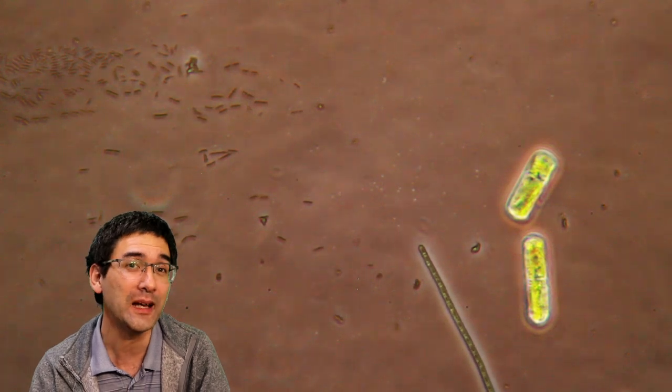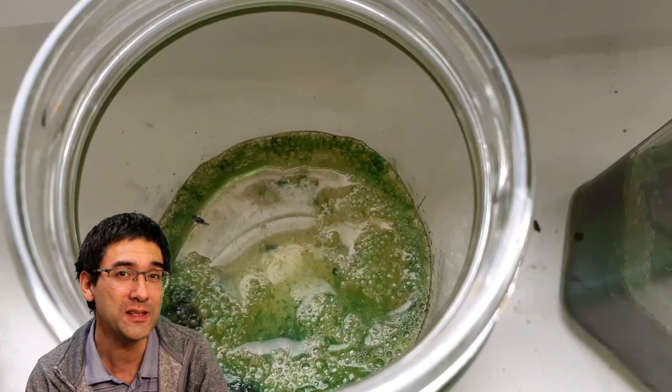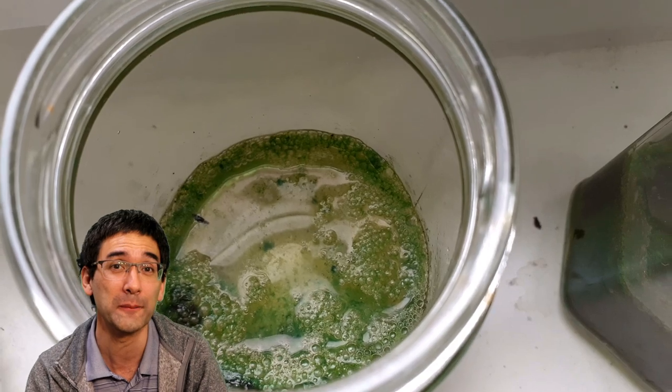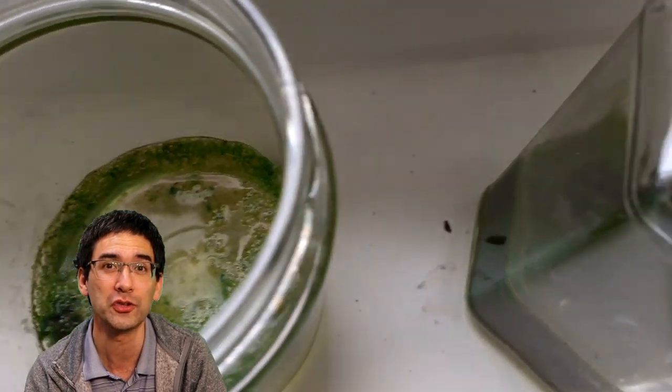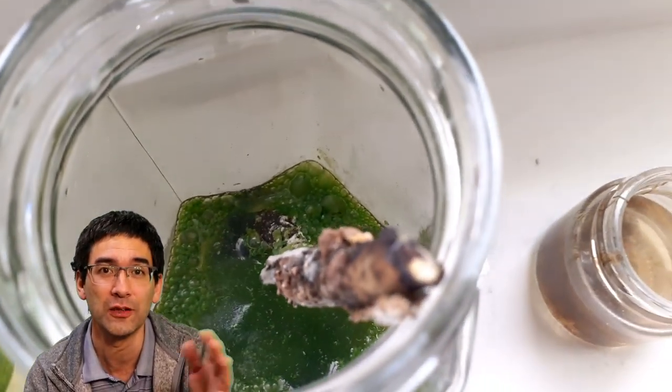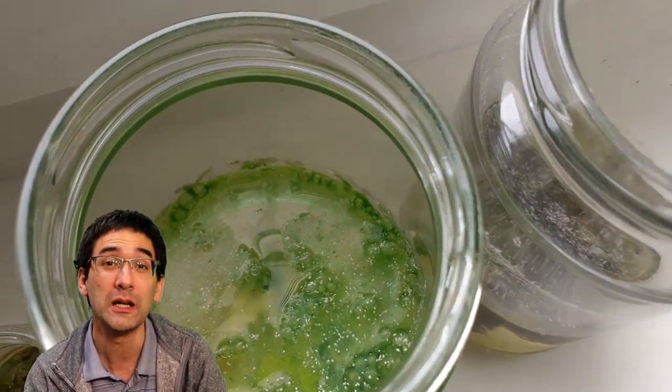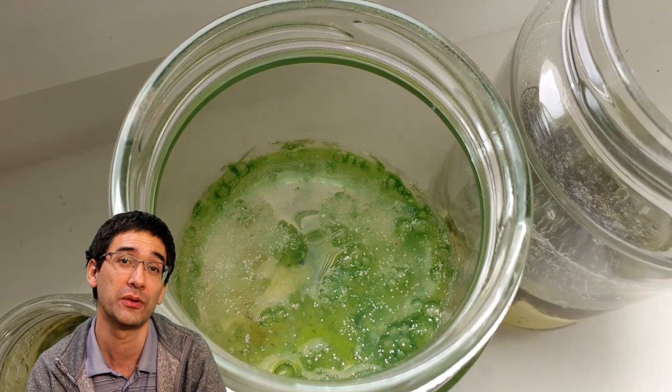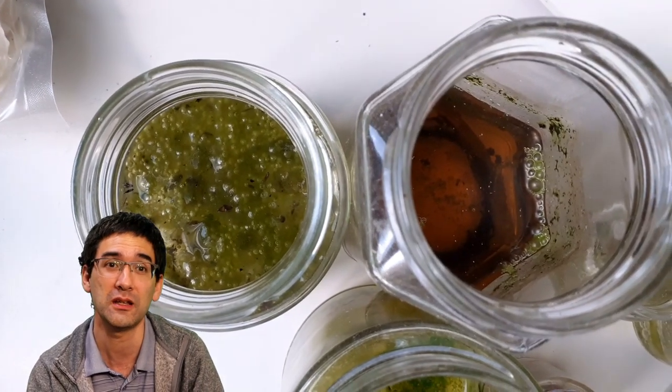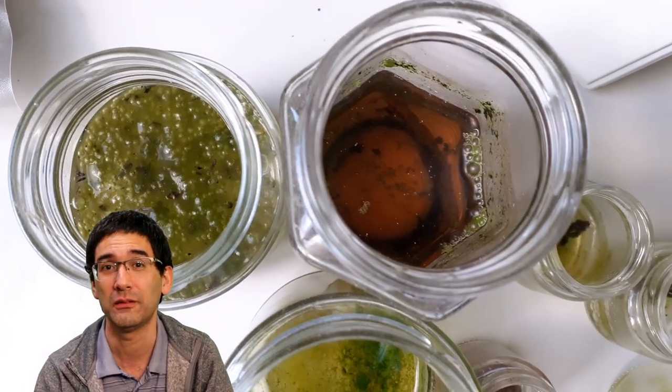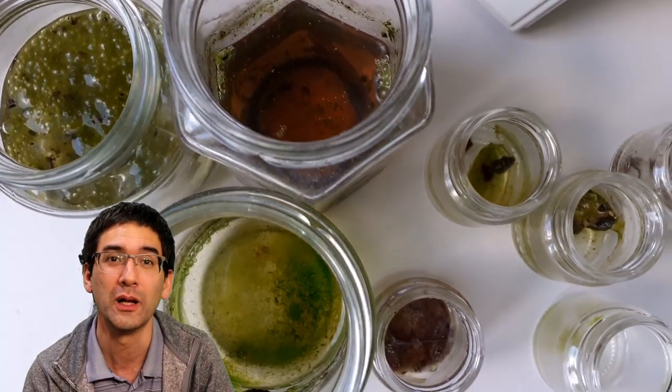I have to admit one thing: you've got to be a little bit careful with these things because you don't know what you're growing. Especially if you're growing cultures that contain a lot of organic substance, like here, for example, a piece of decomposing wood. There are going to be a lot of bacteria in there, so that's something you might want to take care of – it might not be too healthy.